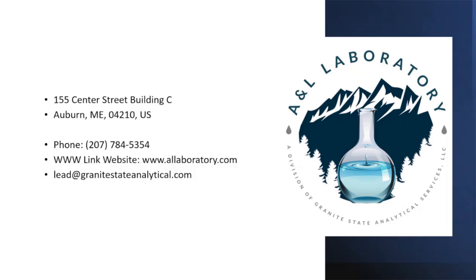Once collected, samples must be delivered to the lab within 14 days. If samples are not delivered to the lab within the 14-day timeframe, the process must start again with all samples collected a second time. Samples may be delivered using one of 15 free drop-off locations or by using a prepaid postage stamp. A list of drop-off locations should be included in the box with your sample bottles.